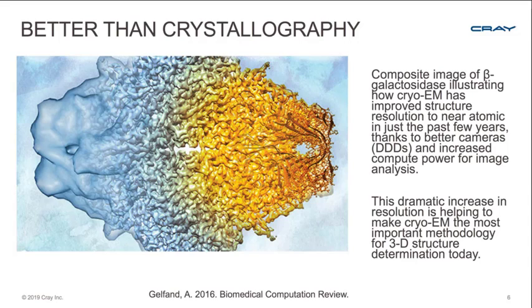In fact, it's much better than X-ray crystallography for certain types of biological molecules that do not crystallize at all. So, a very challenging procedure, but it works very well for those molecules that do not crystallize. Typically that means they're flexible and more complex, and larger molecular complexes of above about 150 kilodaltons.